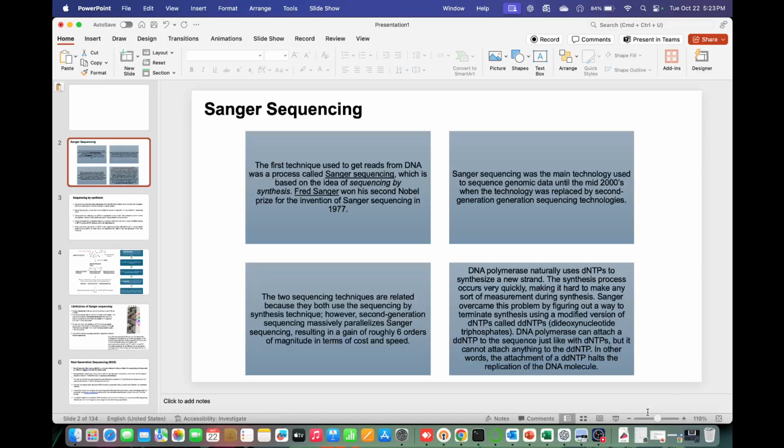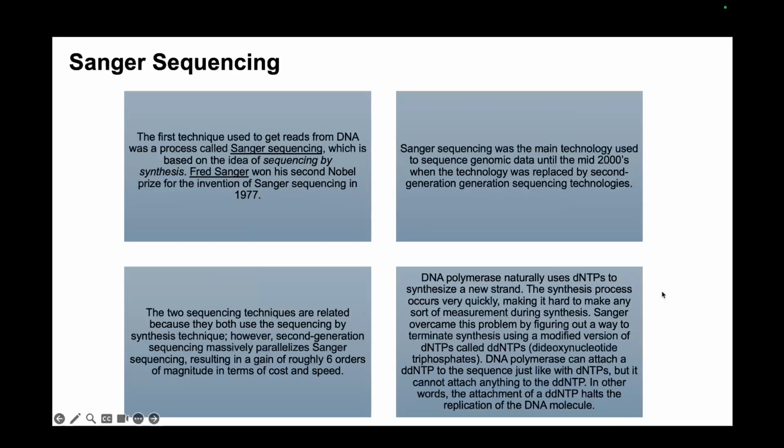Okay. So just to give a recap, we started with different types of genomic sequencing technologies. Then we looked into different types of pre-processing techniques, quality control, and how after generating the data, you can use QC measures on the data. After that, using different pipelines, how you can identify single nucleotide polymorphisms and big structural variants as well. And also after that, we talked about RNA sequencing analysis, different types of algorithms for alignment for RNA sequencing data.